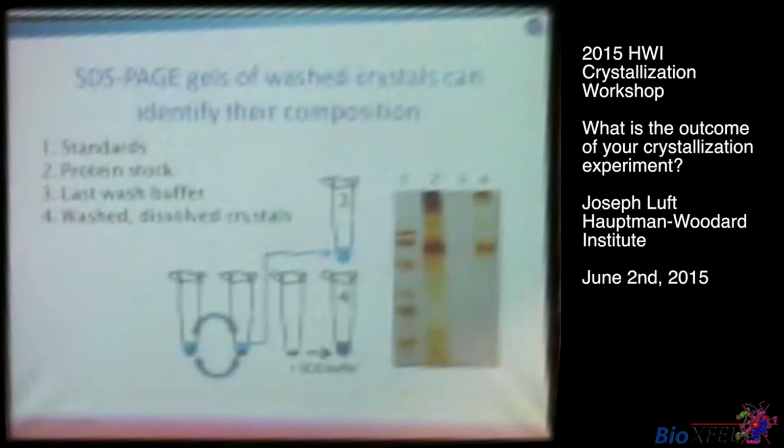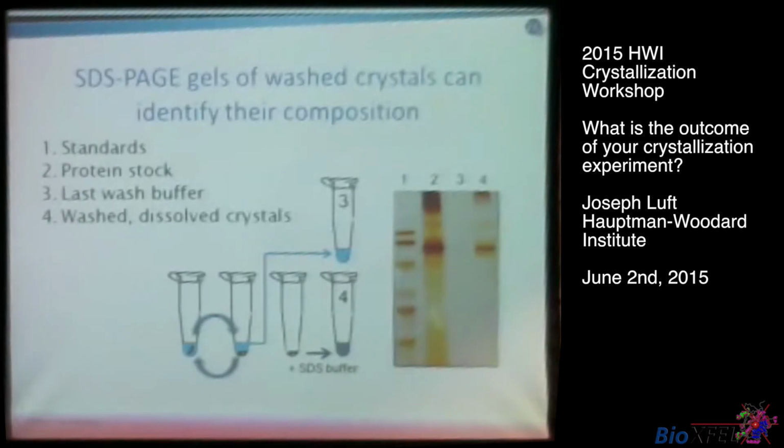The other thing people have done is wash your crystals. You want to make sure you get rid of any protein that's in the solution. You centrifuge it down, do several washes, and then run an SDS-PAGE gel to verify that you have a band showing up where your protein should be from the dissolved crystals.